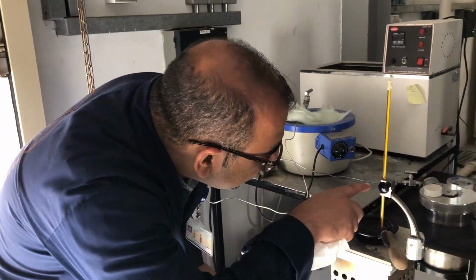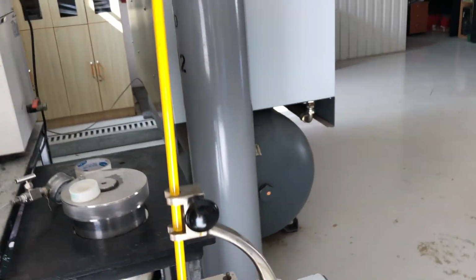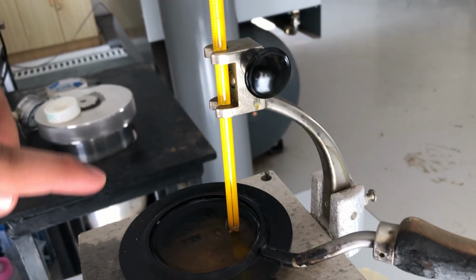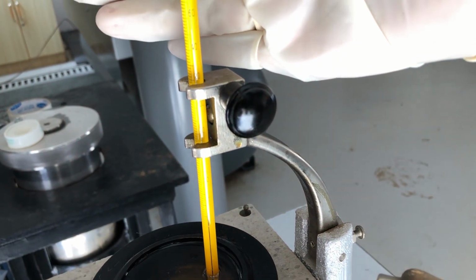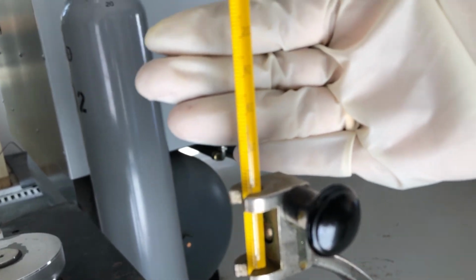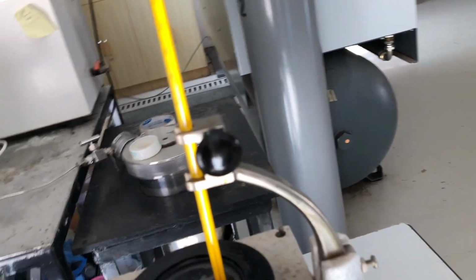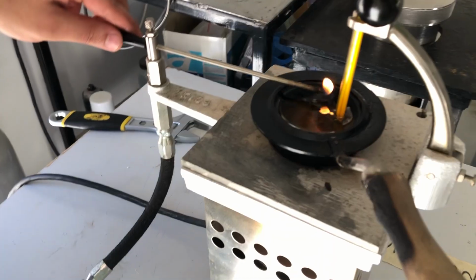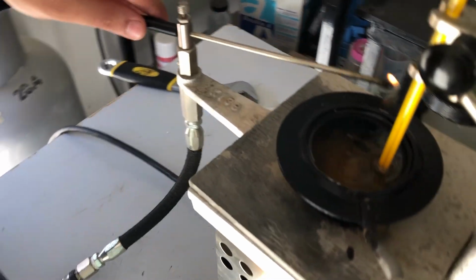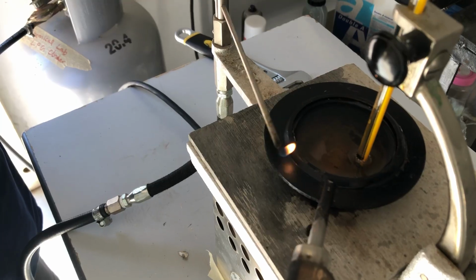See, now the temperature is 140 degrees Celsius, and we see that the smoke is slightly coming, but once I pass the flame, there is still no flash or fire forming. So we have to continue and keep moving the flame over the surface.